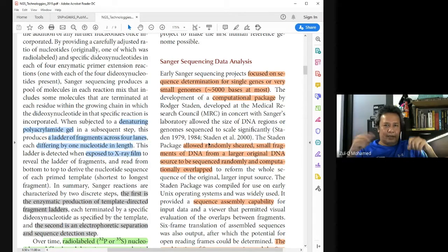Later on, and I'm going to emphasize this point, you generate short fragments against a background of the whole genome, so that requires a lot of computing ability. During this time, Sanger sequence analysis only went back to the backbone, maybe the length of the vector of whatever you had cloned before.